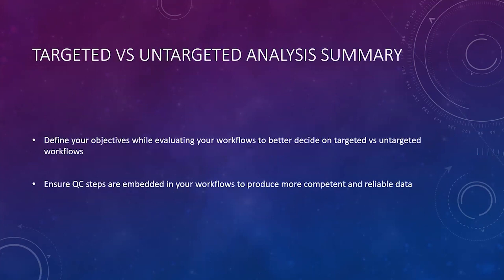So our summary basically says: define your objectives when you're evaluating your workflows to better decide targeted versus untargeted workflows, and ensure QC steps are embedded in your workflows to produce more competent and more reliable data. QC is where it's at: internal standards, surrogate standards, CRMs.